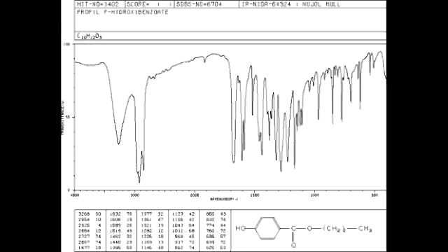So looking at the molecule with the molecular structure and the name here now, we see that it's an aromatic ester with a phenol, not just an aromatic, and we can tell that that OH must be off an aromatic because it's actually sharper than it normally would be. Normally an O single bond H will be broader and sort of smoother, but here it's a little bit sharper.